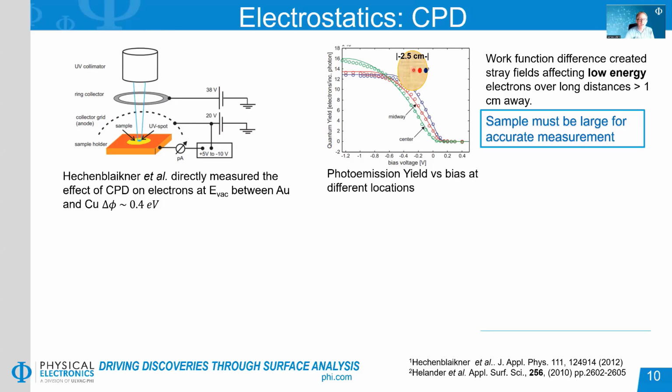You can make a measurement when it's not just that material, nice and big and uniform. But then you have to realize that what you're taking a measurement on is the composite system, not the material just where your beam is hitting.